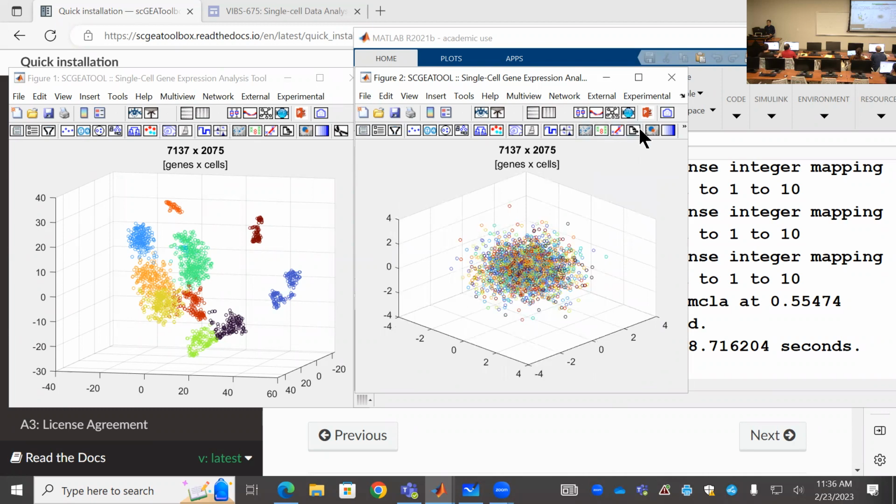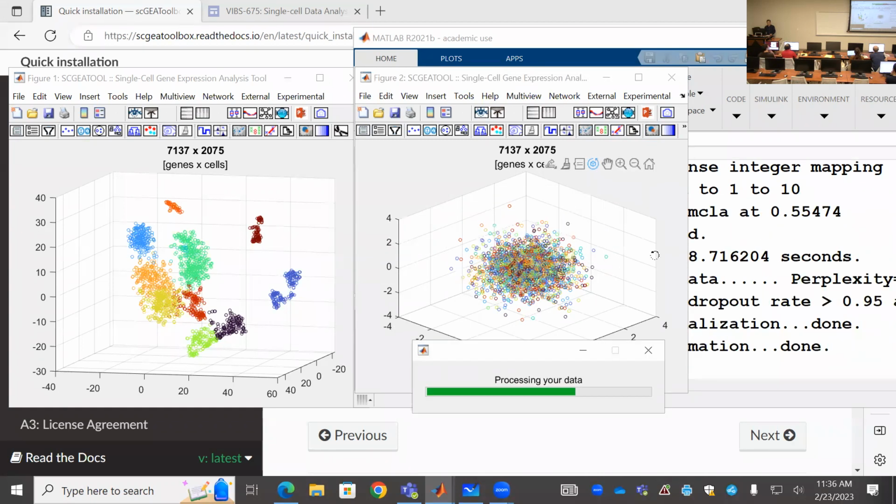So now I want to run embedding on this already clustered cell data. And the embedding algorithm will not use the member IDs of their clustering. It just does whatever independent embedding, right?